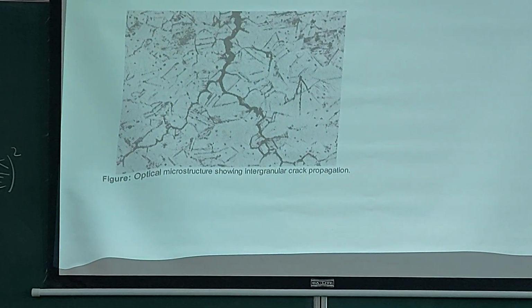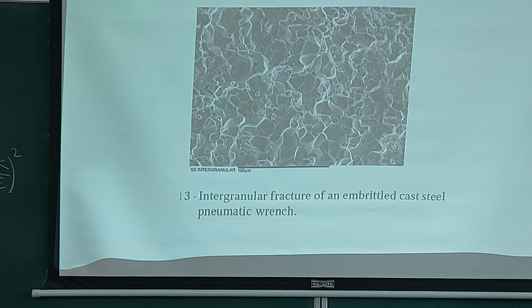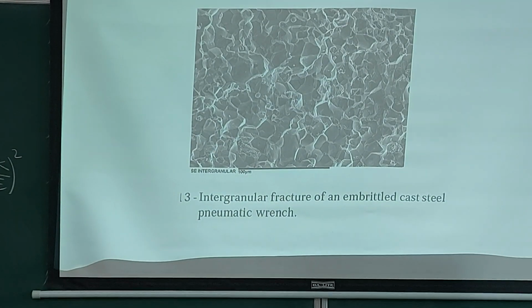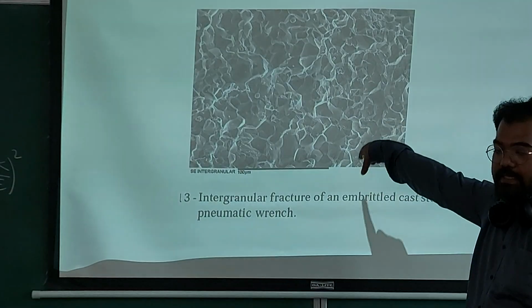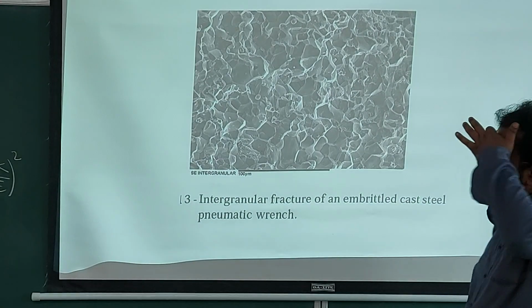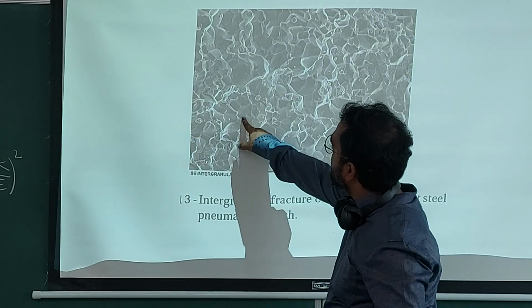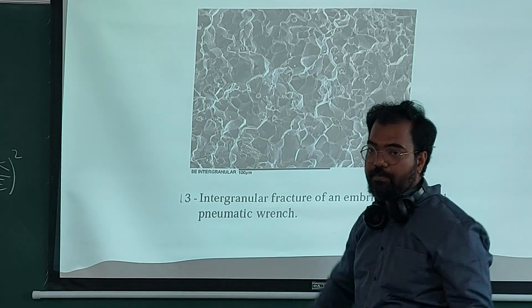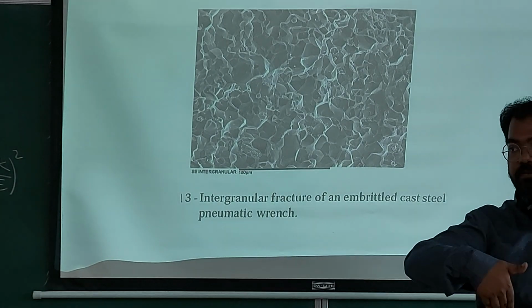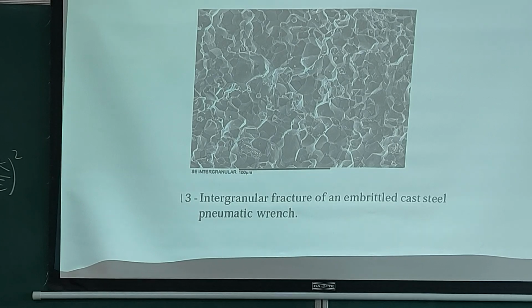Okay. And the fracture surface of an intergranular fracture will look like this. So here you can't really see what that is. Okay. But I think the part is removed in this case. You will see grain boundaries also in this case, and what you see here is that this is one grain, okay, and then you have a step here. This is another grain. Then you have a step there, because it has broken from the boundary, okay, and the boundary is not on one line.